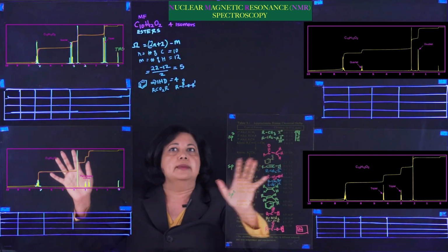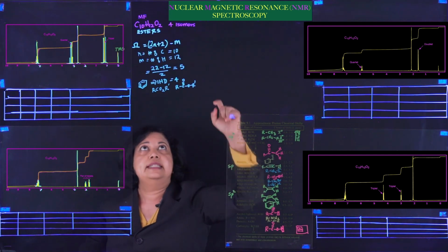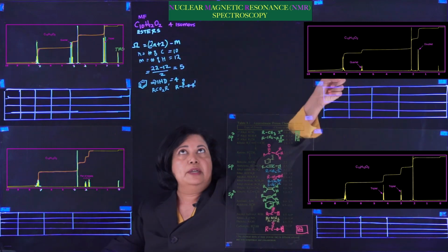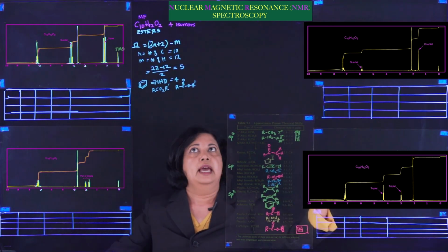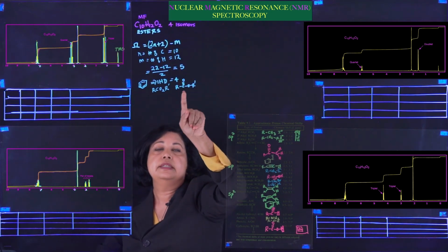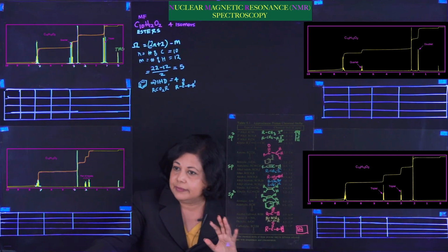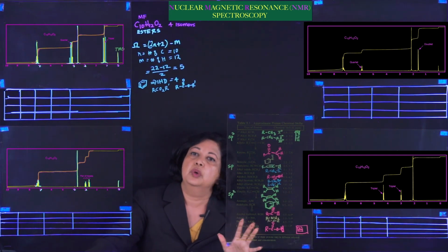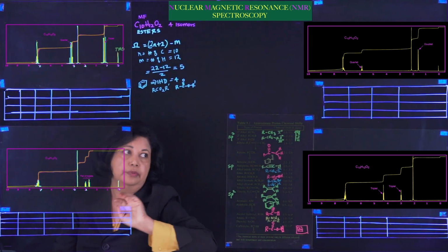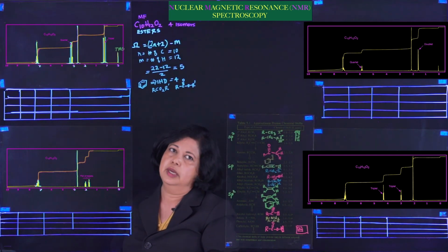So all 4 of them would have very similar infrareds, which is why you really cannot tell isomers apart based on infrared spectra, because all 4 of these have a carbonyl and a benzene and an ester group, COO group. They're pretty much going to look the same. So we have to look at the NMR to find out which isomer is represented by each one of these. There may be more isomers. We're just going to look at 4. There are definitely more isomers than that.